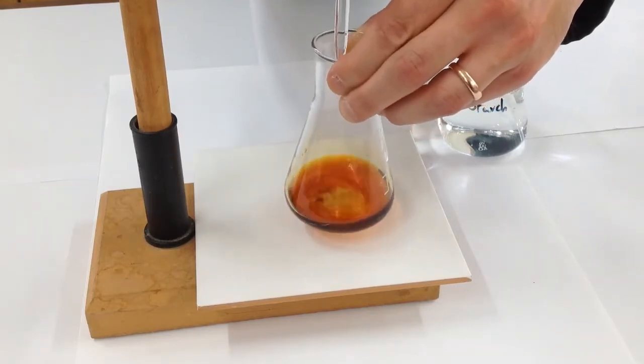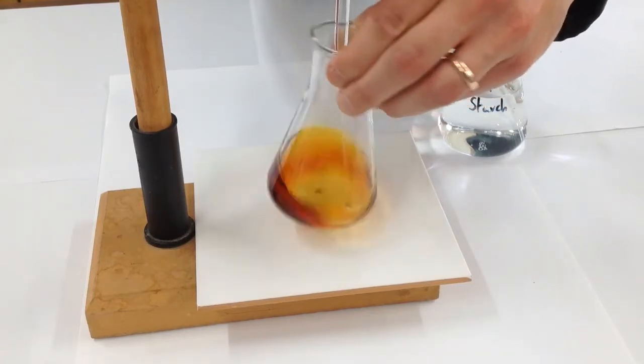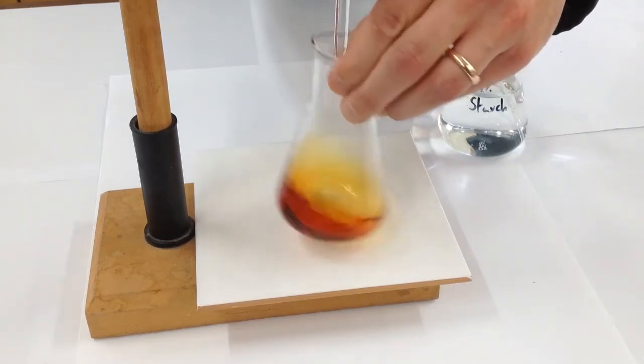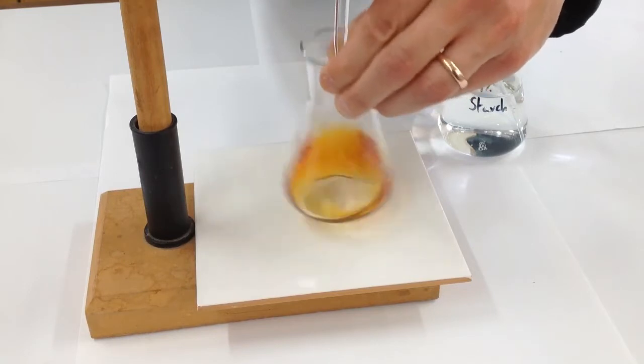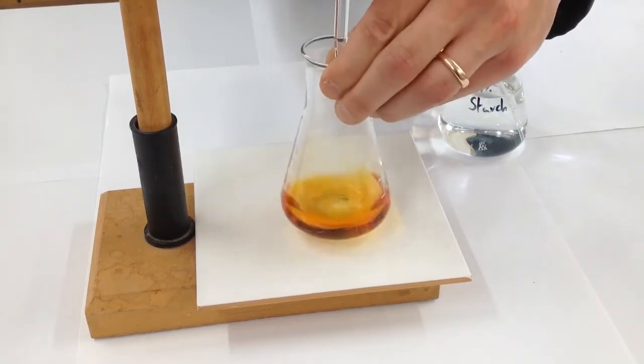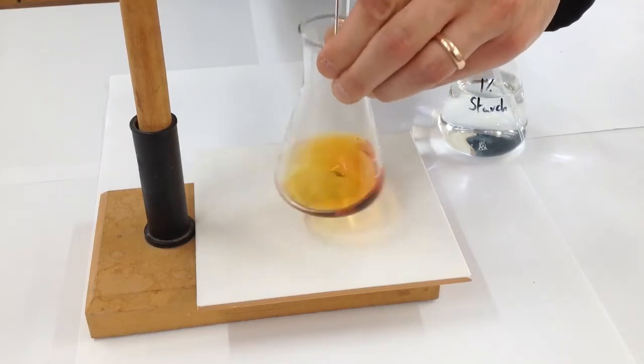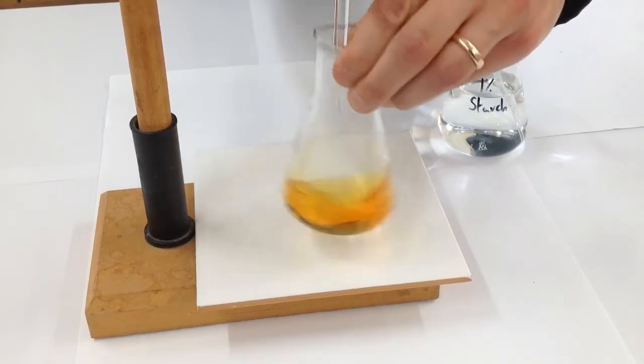So I'm just going to be cautious about how I add that. You can see the colour is fading. It's still a brownish colour. We're aiming for a sort of pale straw colour. So a sort of pale yellow colour. I'm almost there. I just don't want to overshoot this. It's very tempting to add this too quickly and then we overshoot.